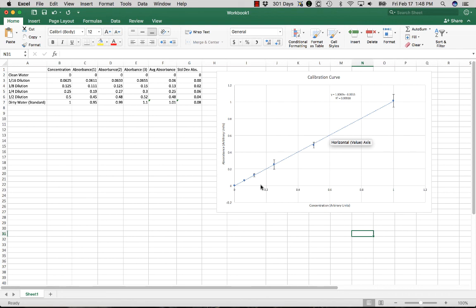A couple of hints or tips: if you find that you're not getting good data with one color LED, switch to a different color. You've got a number of different LEDs that are available to you. Some might be better than others in terms of how they transmit light through that particular sample and that particular dye.